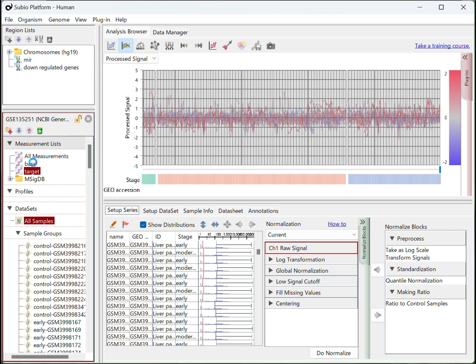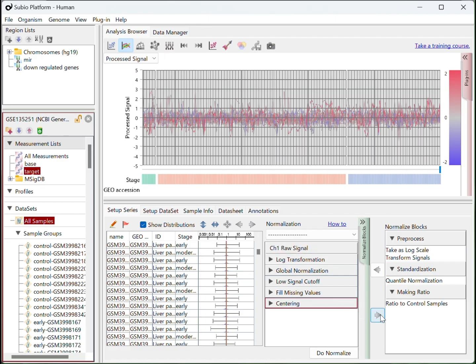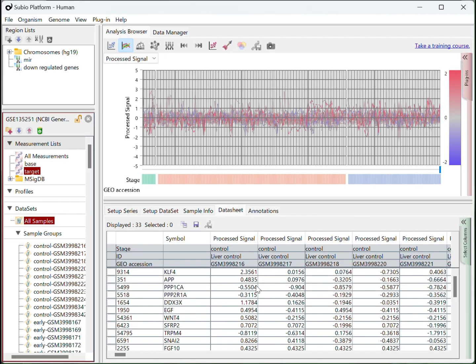Let's say there are base and target gene lists, and I want to separate samples based on the relative expression levels of the target genes to the base genes. You can use either ratio to the average or the normalized counts. If you take the latter, remove the centering from the normalization setting.